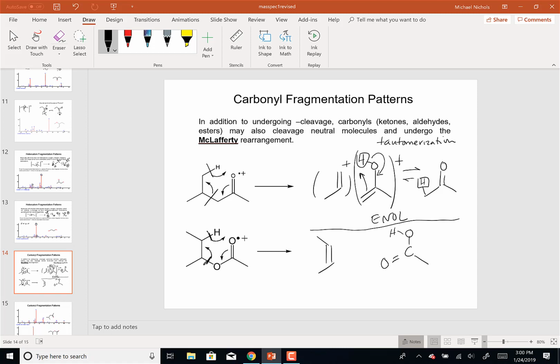So how could you determine what a fragment looks like? What's its structure? Well, this is the same technique used if you go have a drug test. They're going to actually test the metabolites of that drug that's probably in your urine.